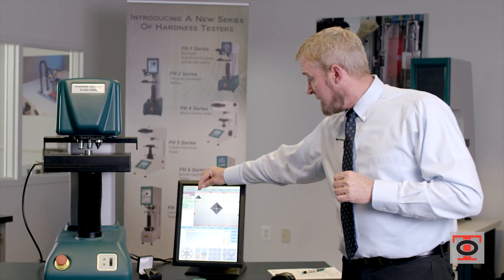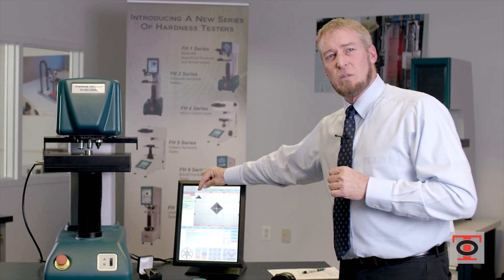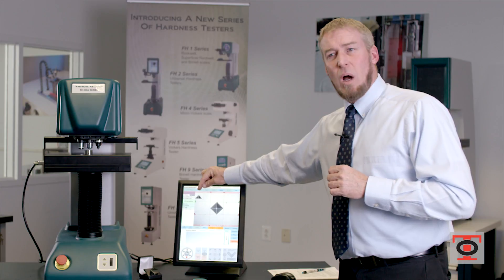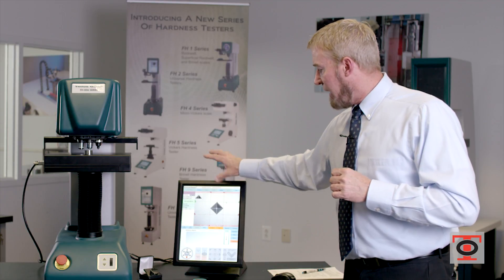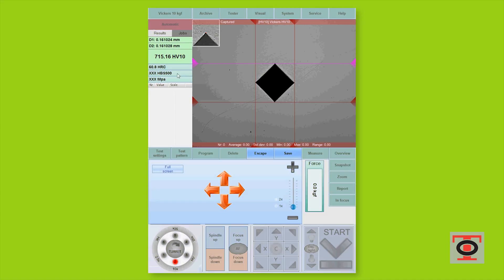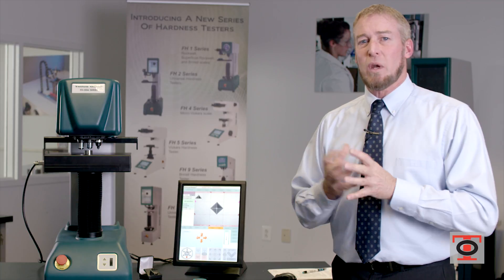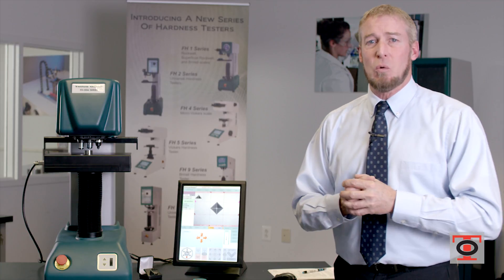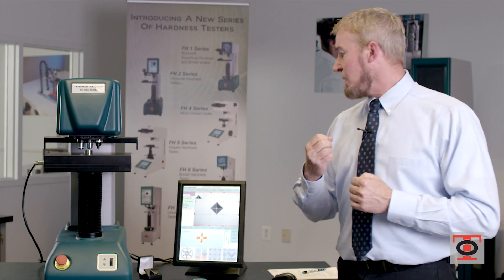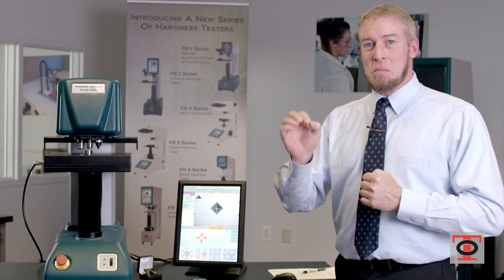So now when I look at it, I see a little red dot up there at the apex of the point — it's off just a touch. Now I'm going to move that, but instead of moving it by touch screen or by the mouse, when I click on that line at the bottom, I get directional arrows. The reason why there are directional arrows is that what we're doing now is moving in microns — not what my hand can do and control. We're doing something that requires enhanced computer electronics to move in microns.